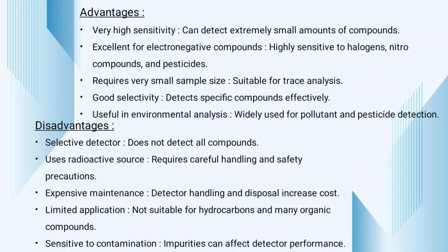Disadvantages: selective detector, does not detect all components, requires careful handling and safety precautions. Detector handling and disposal increases cost. Not suitable for hydrocarbons and many organic components. Impurities can affect the detector performance.